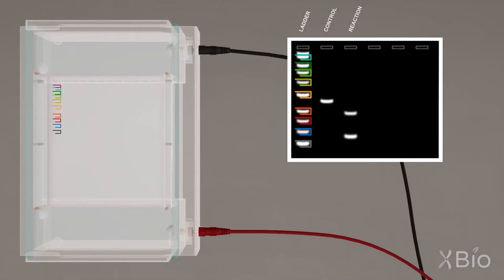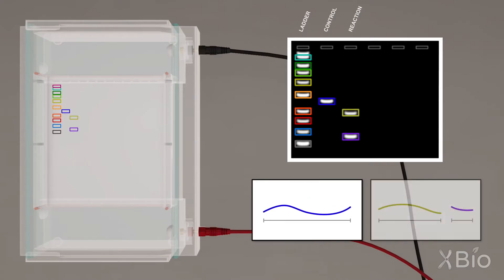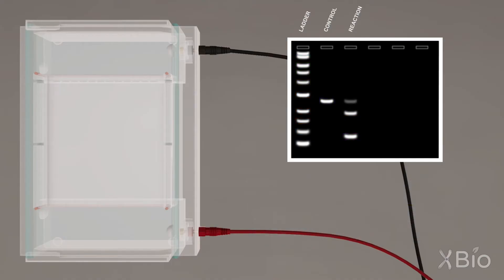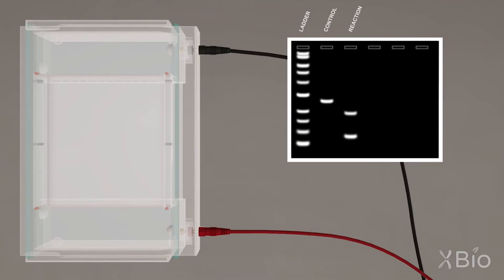Now when we run the gel, we get a lot of information. We see that the ladder bands are running at the expected sizes, we see that the uncut DNA is also the expected size, and we see that the two smaller bands correspond to two pieces of DNA that resulted from a single cut at the expected site. If there's a trace amount of uncut DNA, we could quantify the relative amount to get an idea of the efficiency of our reaction. All of this planning also made us better prepared to notice unexpected results, which can be the harbingers of new discoveries.